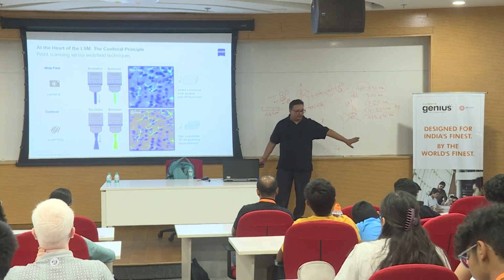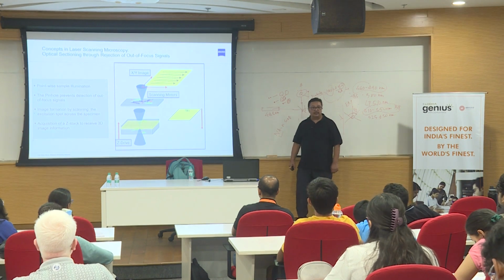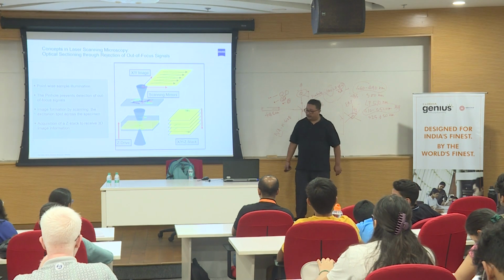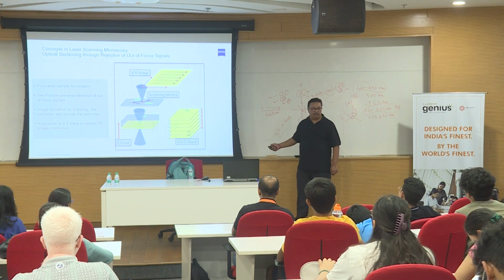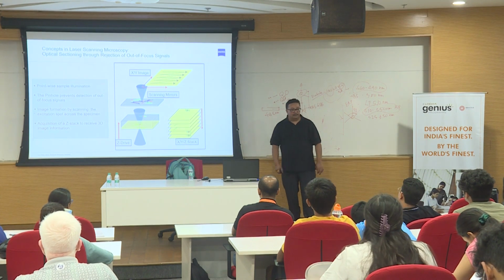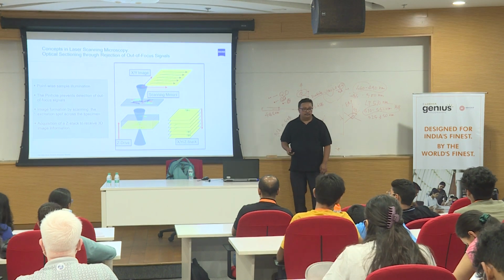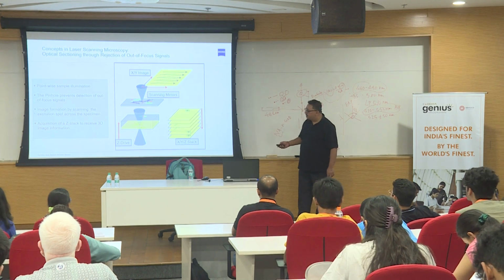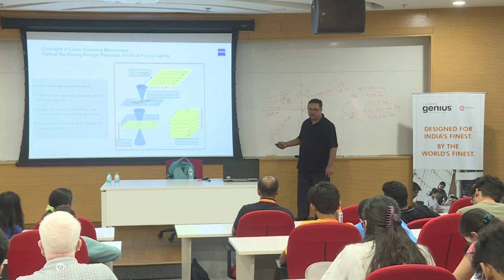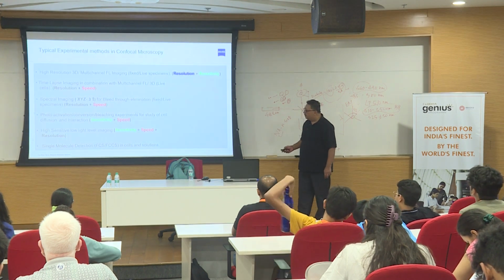So far clear? Good. So now, this is how you try to do a Z-stack, and that's the answer to a question: how do you do a Z-stack and how do you collect a 3D volumetric? Every single plane you acquire an image and you collect all this information to create a volumetric rendered data, or like the MIP which I mentioned right now. And the basic advantage is in-focus information at every focal plane. You don't have any haze information from the above and below focal planes.